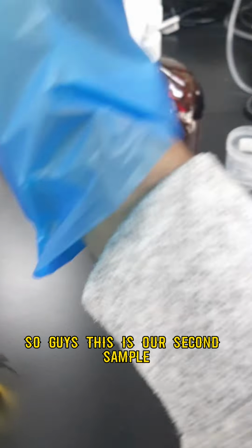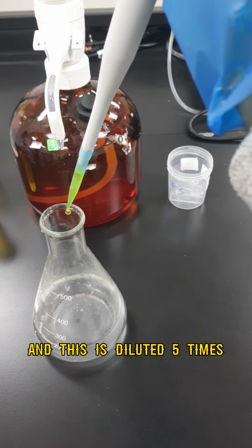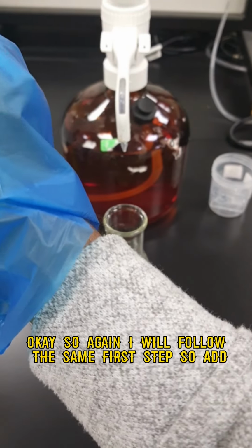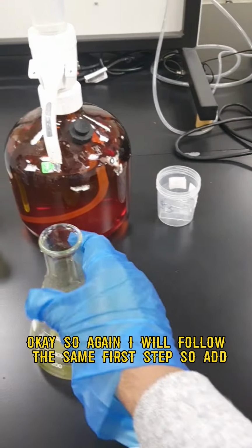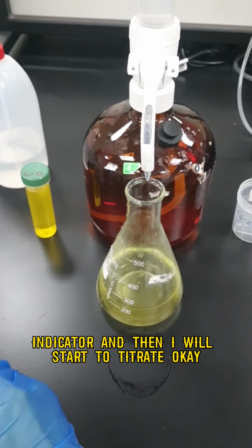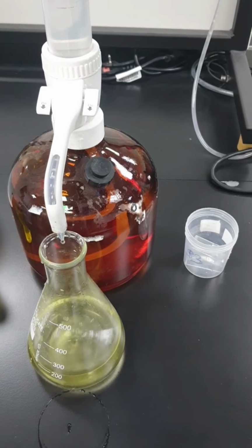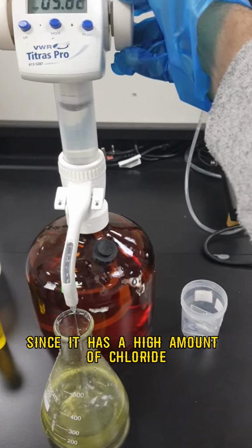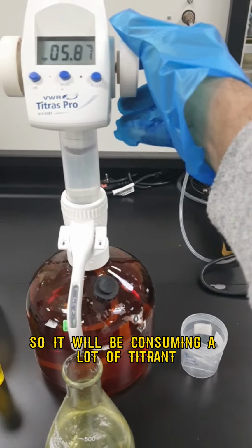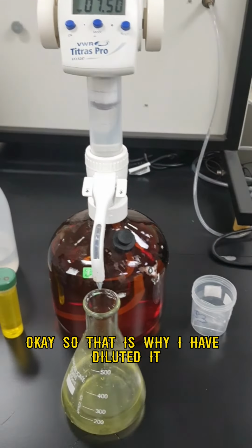So guys, this is our second sample, which is a seawater sample, and this is diluted 5 times. Again I will follow the same process steps. I'll add indicator, and then I will start to titrate. Since it has a high amount of chloride compared to the tap water, it will consume a lot of titrant. That is why I have diluted it.